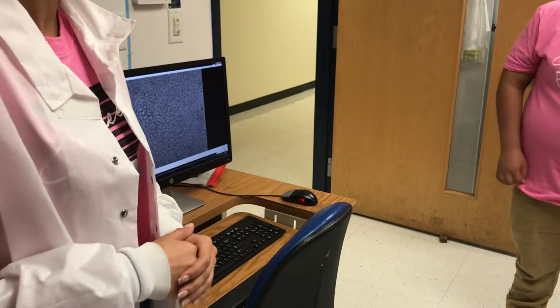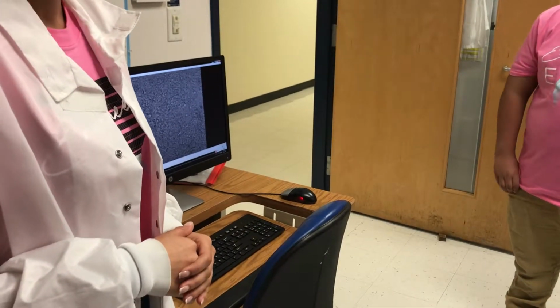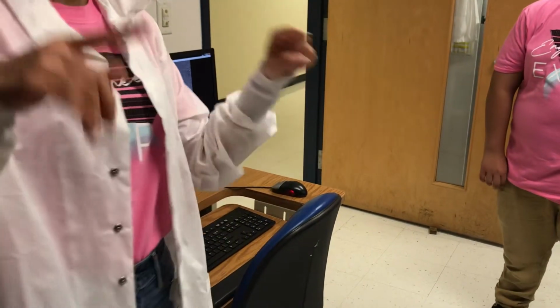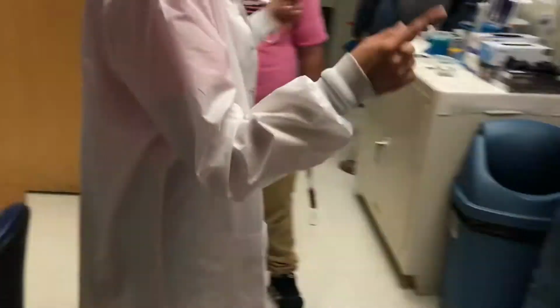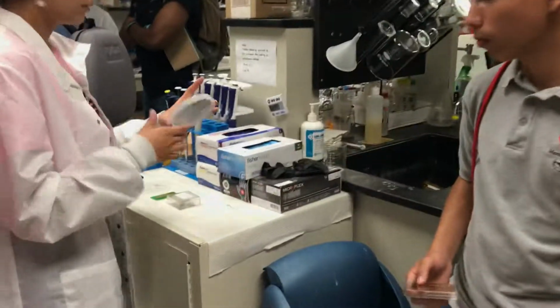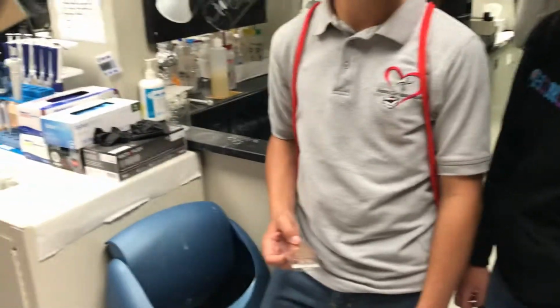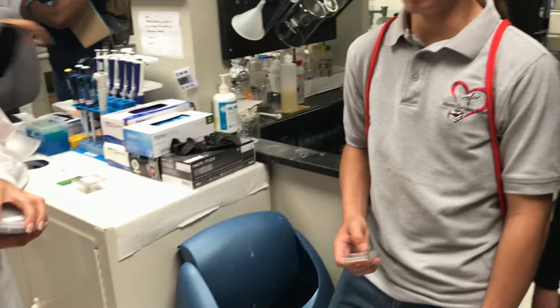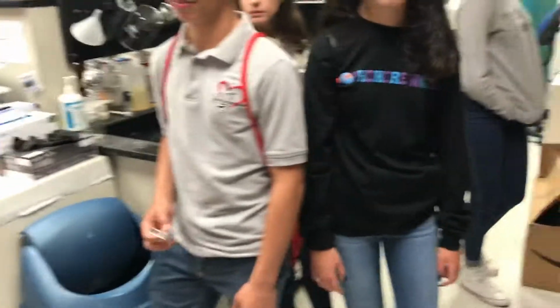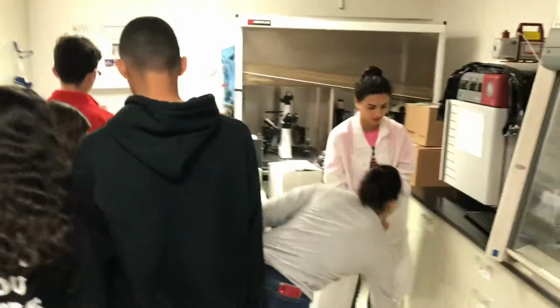All right? Any questions? Do you have any questions with the setups over here? You can go around. This is other stuff that we have over here. We use also microelectrodes. Can you show the guys where you grow the cells? Where you have the cells that in 7 days might be beating? You want to see the cells, you mean? Okay, you can show. All right, sure. Come over here. You guys can stand on that side. All right?